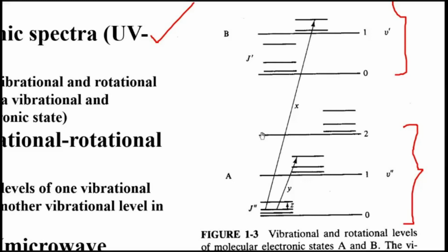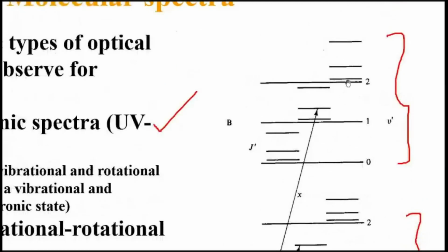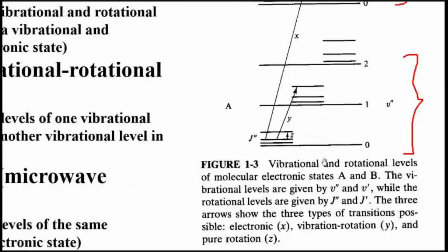Now focus on the longer lines only. When the energy is sufficient, the electrons jump from a lower energy level to a higher energy level. See, these 0, 1, 2 are corresponding high energy levels. What you can see here are longer lines and smaller lines.